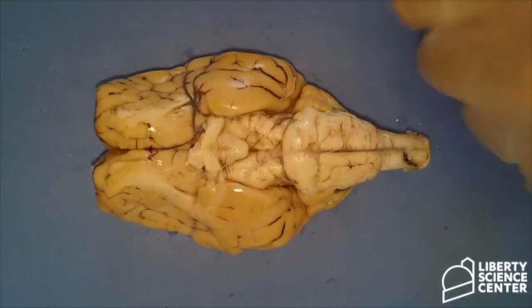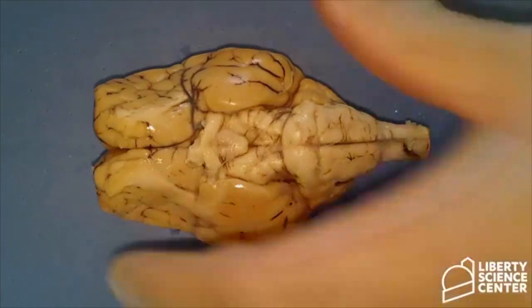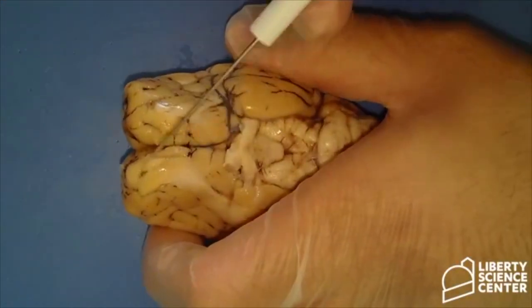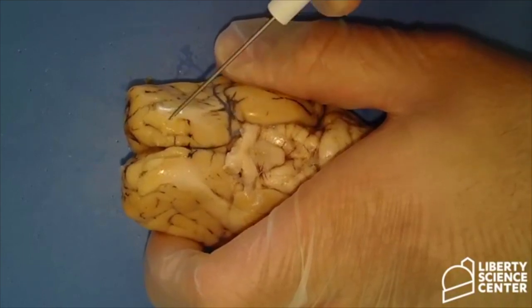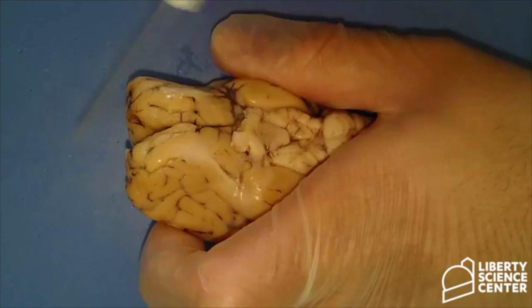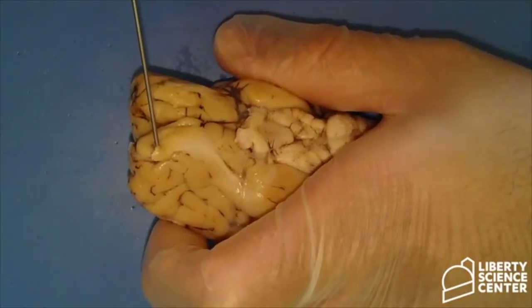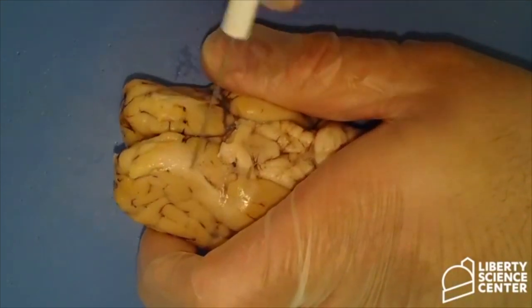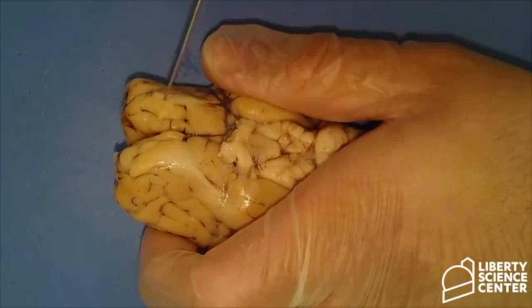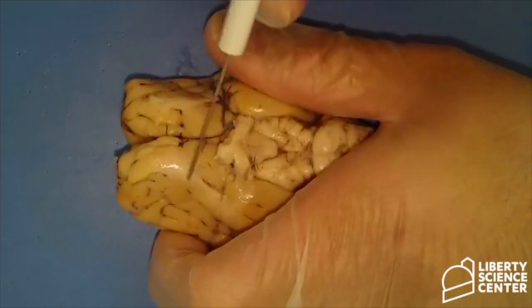So very good question. All right, so let's go back to our brain. There are some nerves that we can point out. What we see here is two nerves right out the gate. It's not very pronounced here, but we can see it right here. Actually, can I lift it up a little bit? If you notice, I'm lifting it up a little bit. This right here is called the olfactory bulb. There's one here, you can see it right there, and there's another one right here.